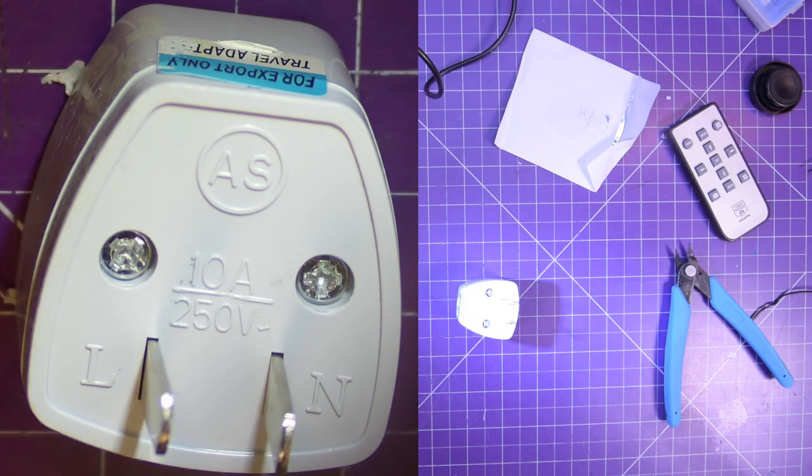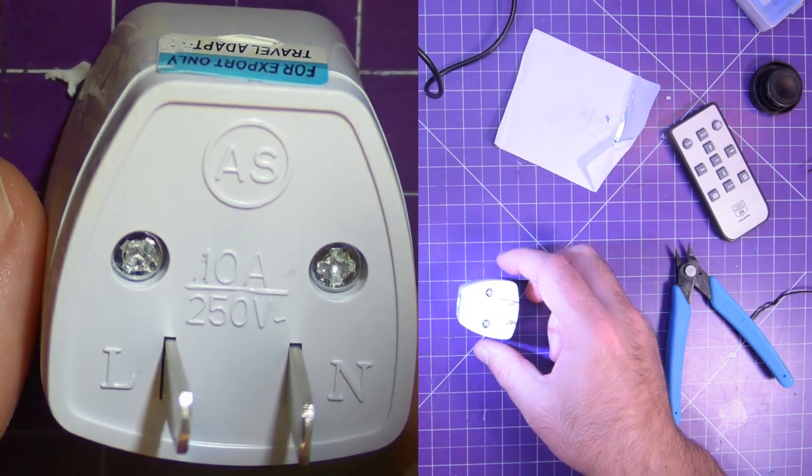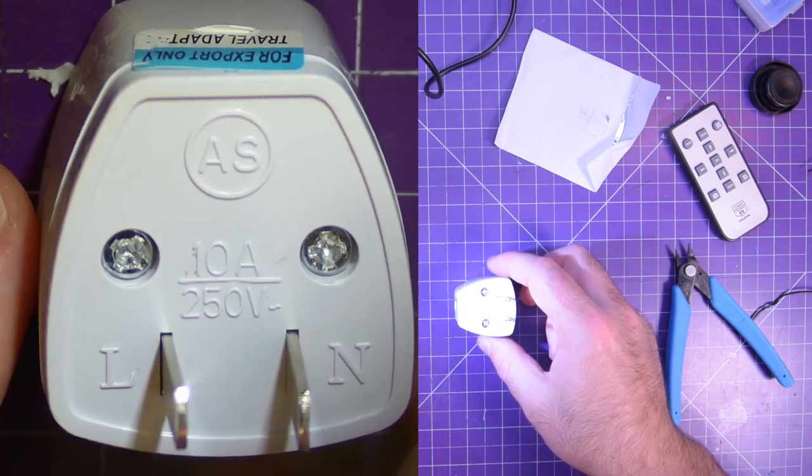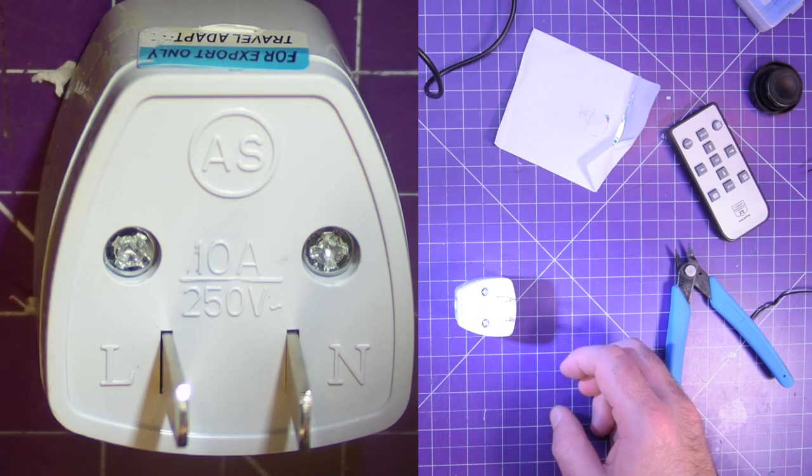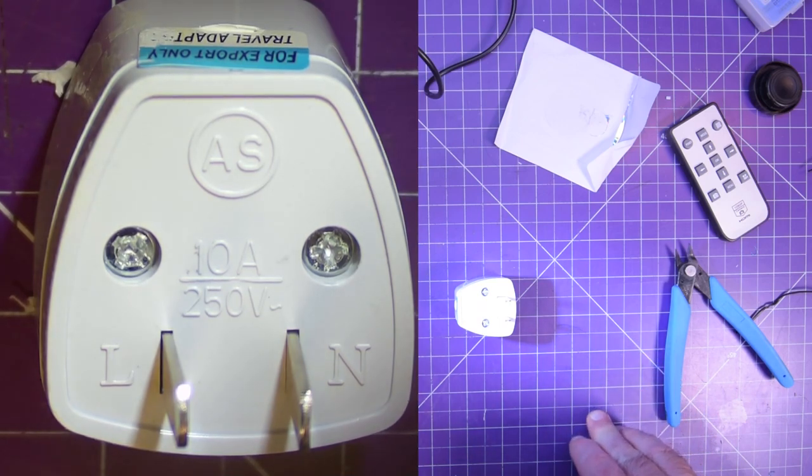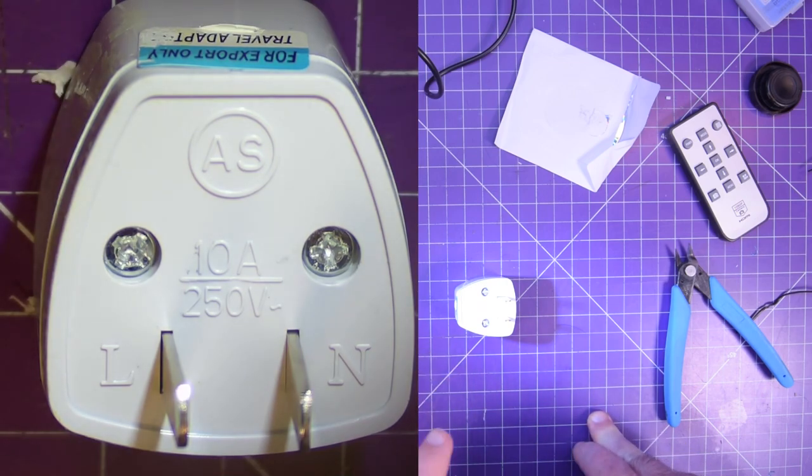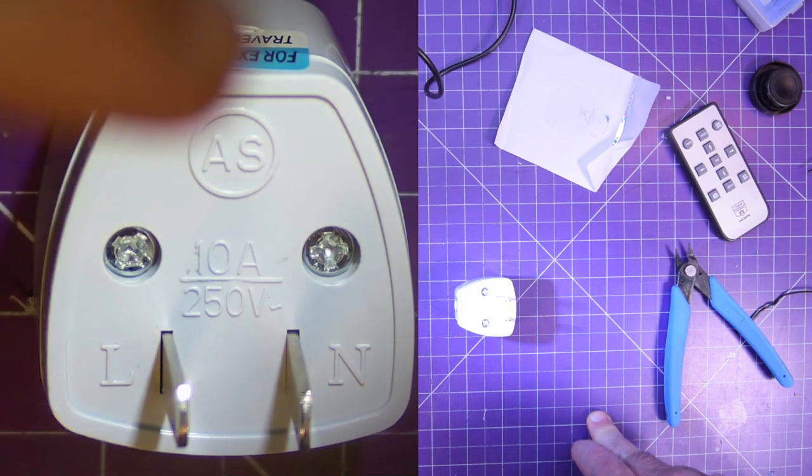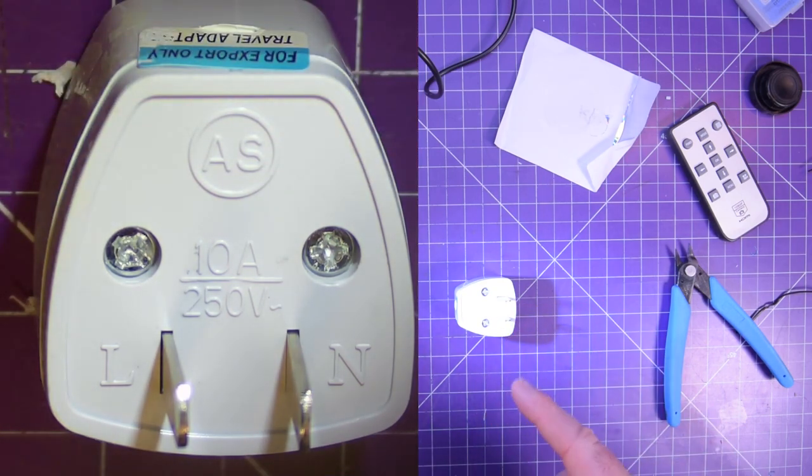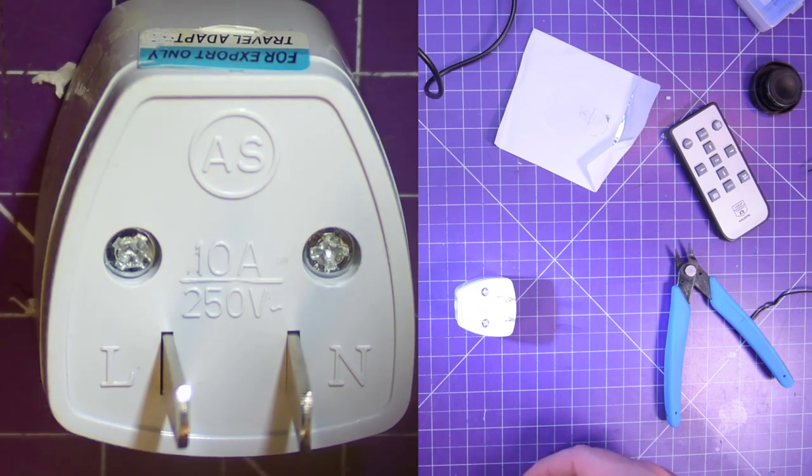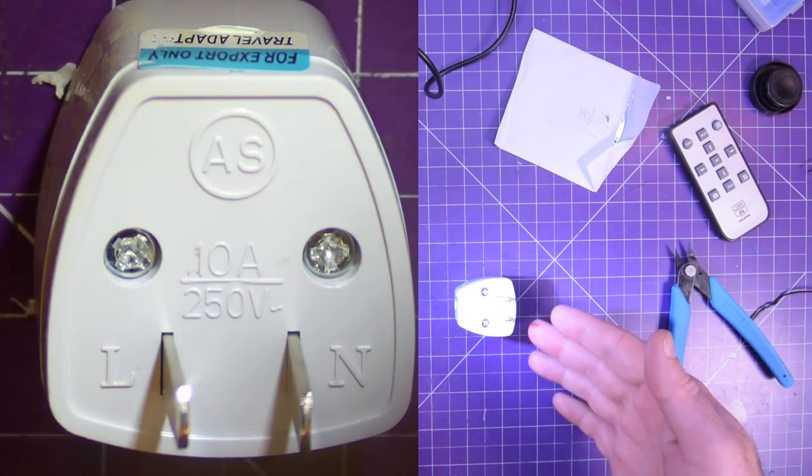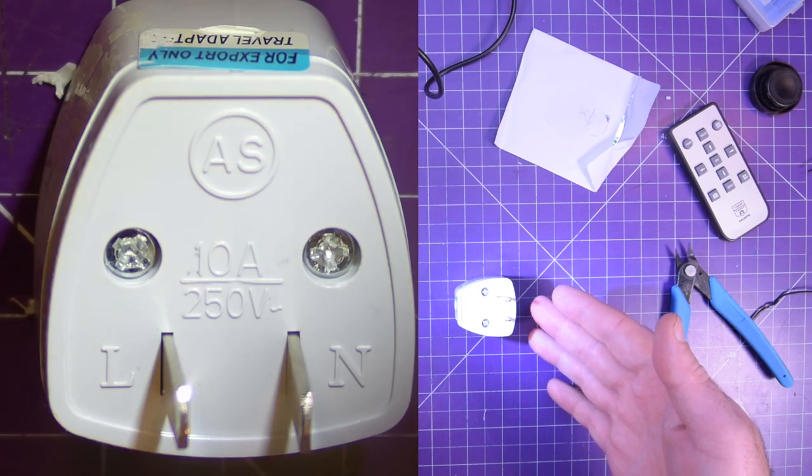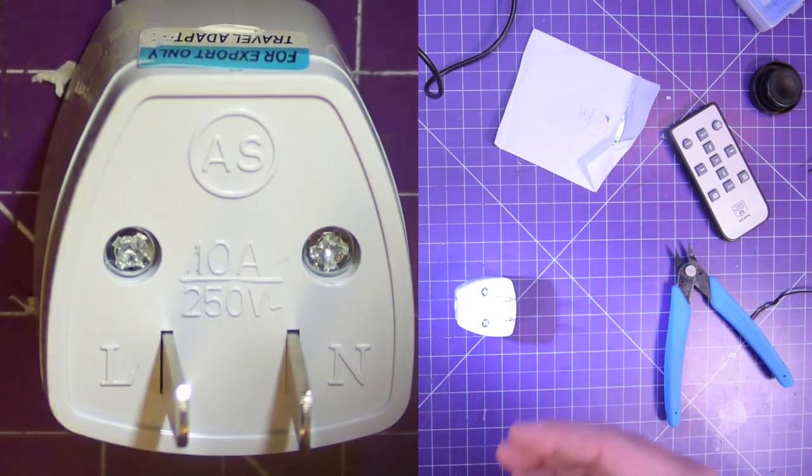So I don't really have that much working distance, probably to the bottom of the lens. Yeah, probably just about chest high. This camera is a solid 25, 20 centimeters higher than that. And look at how good it looks. This looks awesome. And it has manual focus, manual aperture, and that little ring that came with it. You'd have to install that on or else you can't focus this close. So in fact, if you lengthen that ring, so if you 3D printed an adapter, you could have the camera a bit lower. But I mean, this is ridiculous. I love this. This is exactly what I wanted.